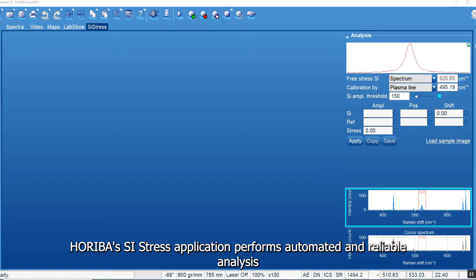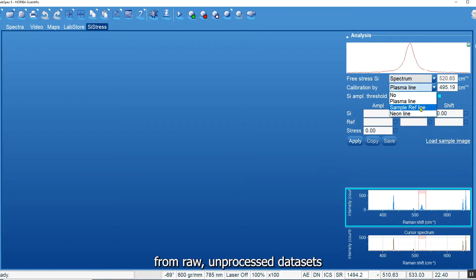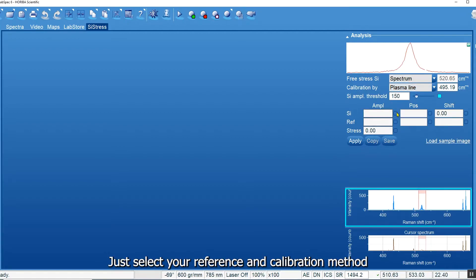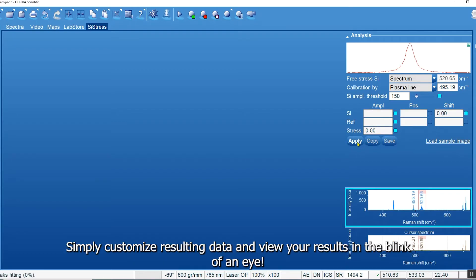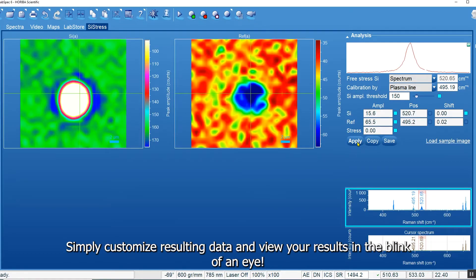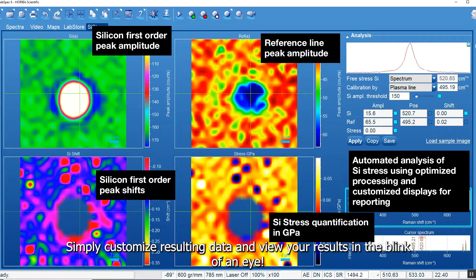Horiba's Silicon Stress app performs automated and reliable analysis from raw, unprocessed datasets. Just select your reference and calibration method, and easily attain high-precision analysis. Simply customize resulting data and view your results in the blink of an eye.